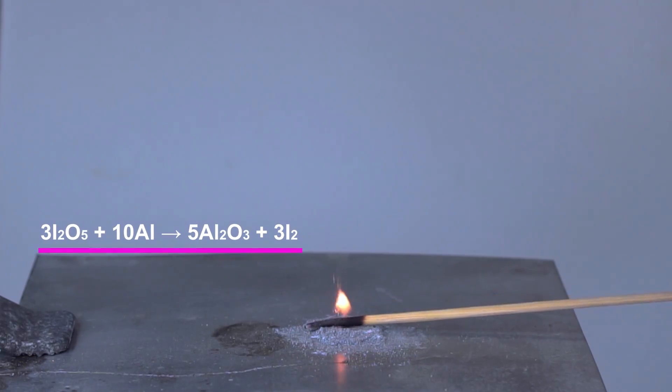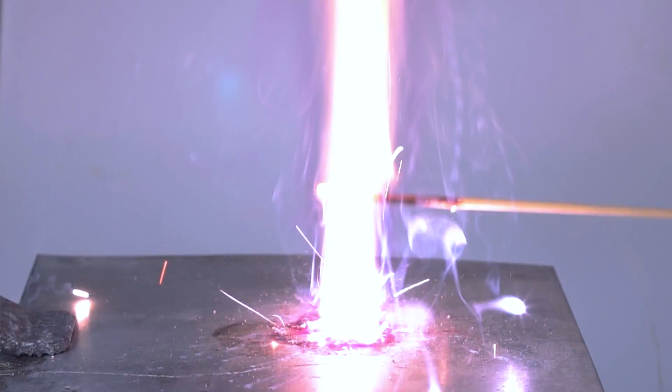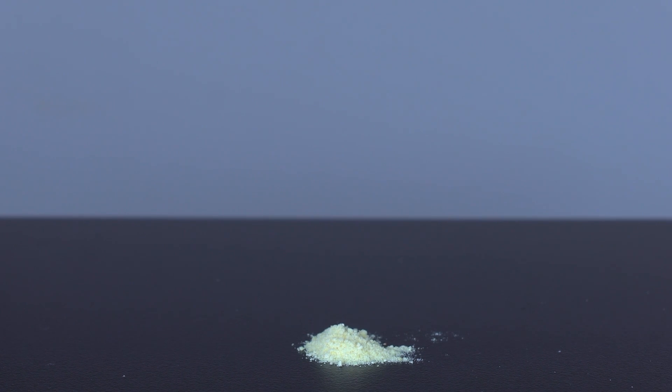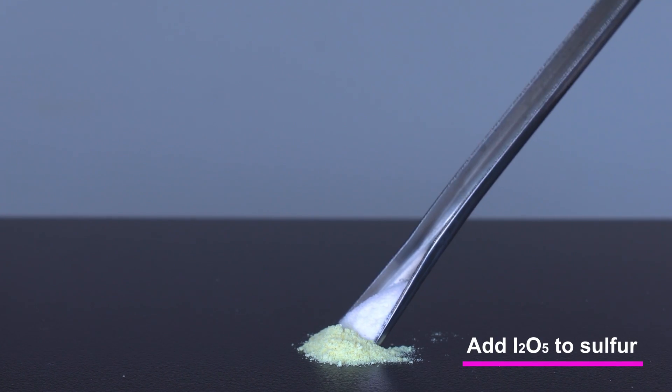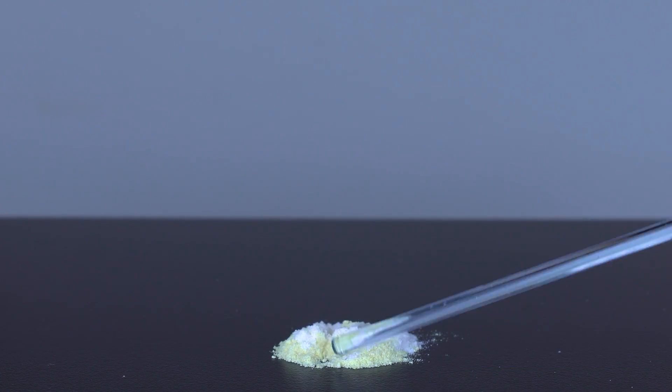This is how the concoction of aluminum powder and iodine pentoxide burns. To initiate reactions of either elemental sulfur or sugar powder with iodine pentoxide, all you need is to touch your mixture with a heated glass rod.